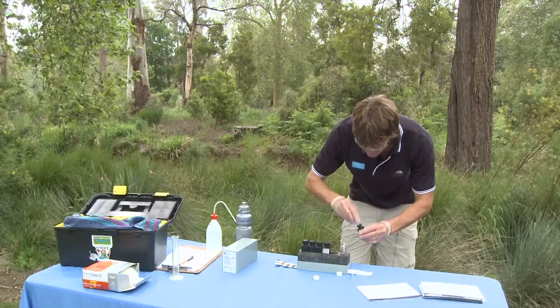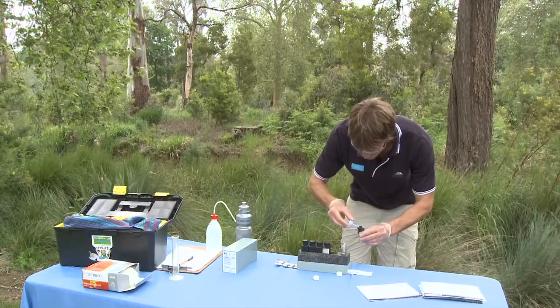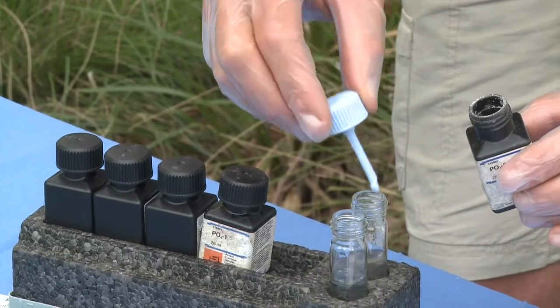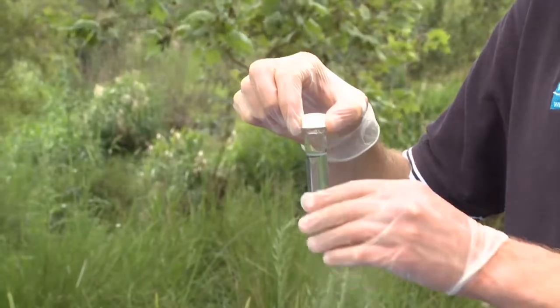Step 5: Add one micro spoon of reagent P2A to the sample tube. Replace the lid and mix to dissolve.